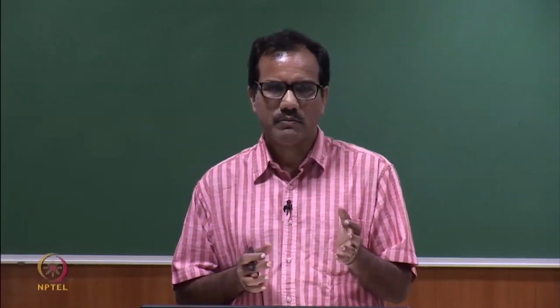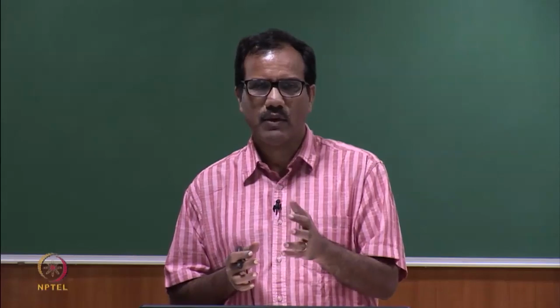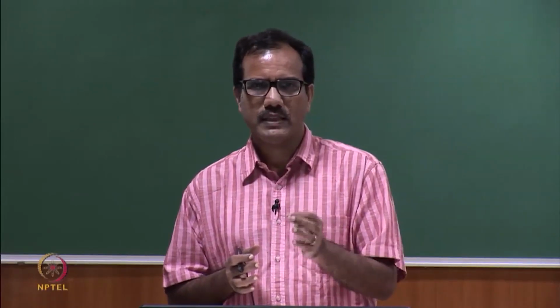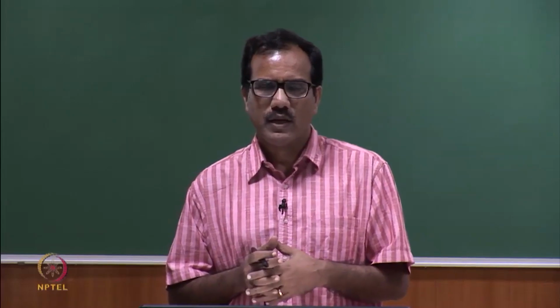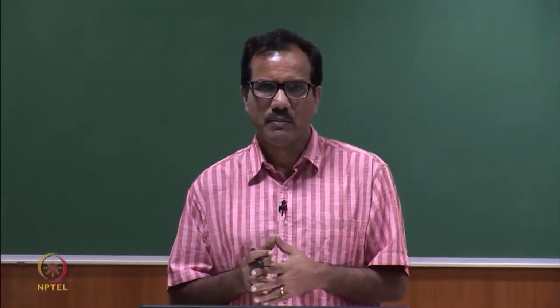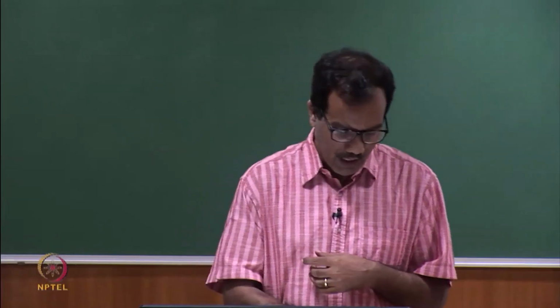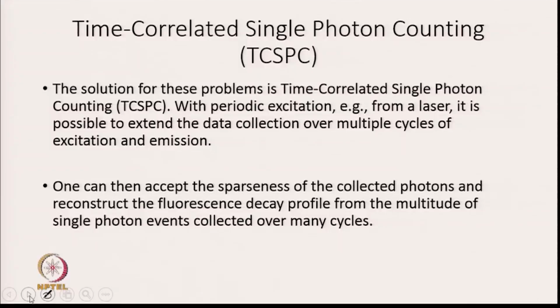The problem can arise when the observed sample consists of just a few or even a single molecule, and that is the situation commonly found in confocal microscopy applications. Now, what is the solution? The solution is a method called TCSPC, which stands for time correlated single photon counting.